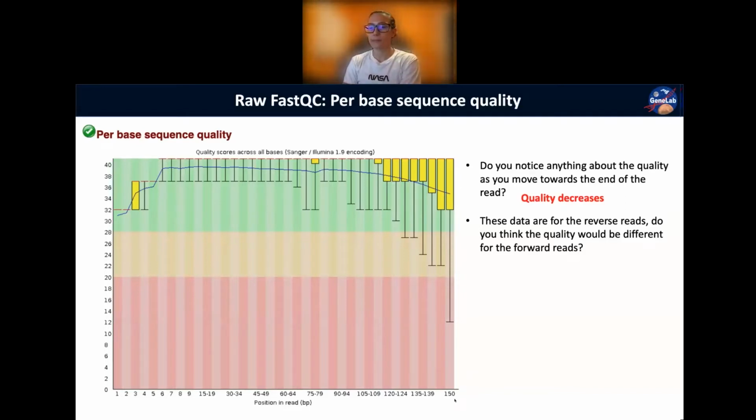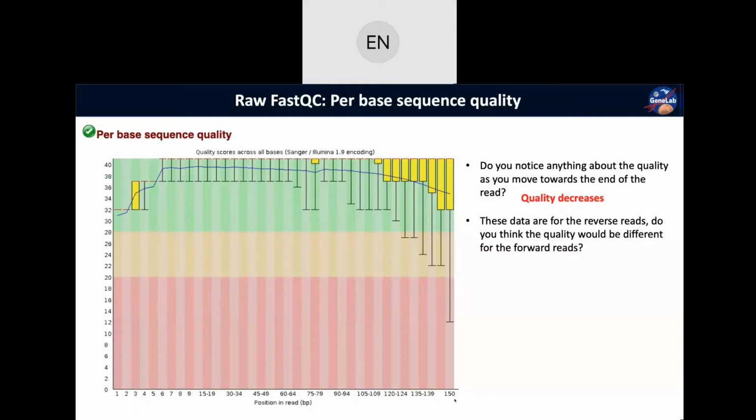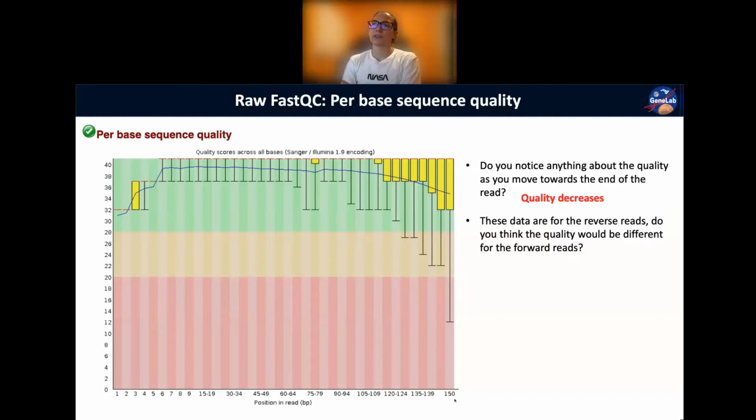And what about the quality at the beginning? Is that just the enzyme binding? Yeah, kind of the enzyme hopping on. You usually do see a little bit of wobble at the beginning. Sometimes we'll notice in the notes too, that it's just not as clean a base call right at the beginning.